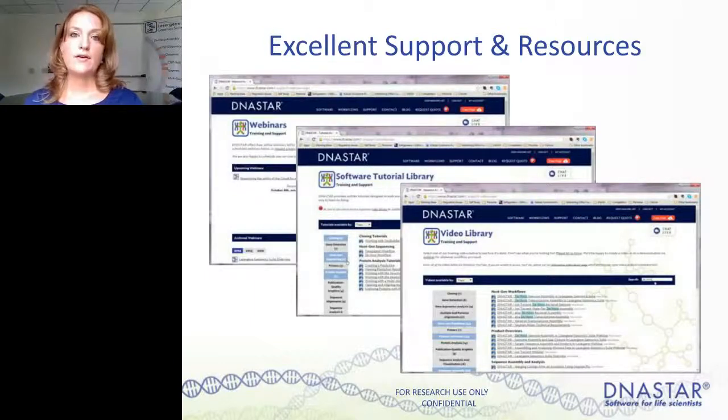And then we have over 200 videos in our video library online. And these videos are all very short and sweet. They're less than 5 minutes long. So if you're new to DNASTAR software or you're doing a workflow that you're not used to, these 5-minute videos are designed to get you up and running, give you a jump start on your workflow and get you started.